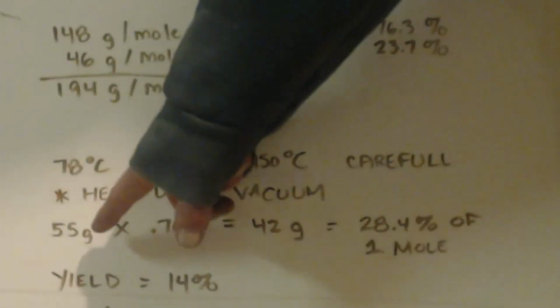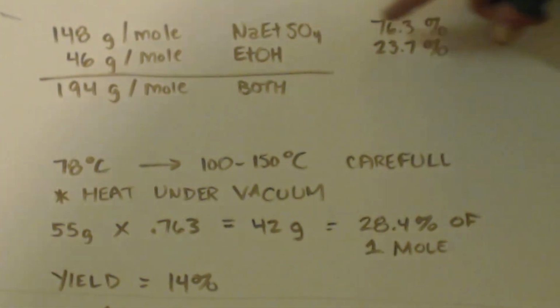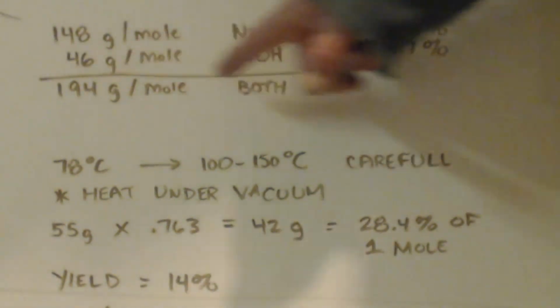Now I got about plus 55 grams. You can see up here, 76.3% is this, if I'm right about it forming this crystallization with the ethanol.